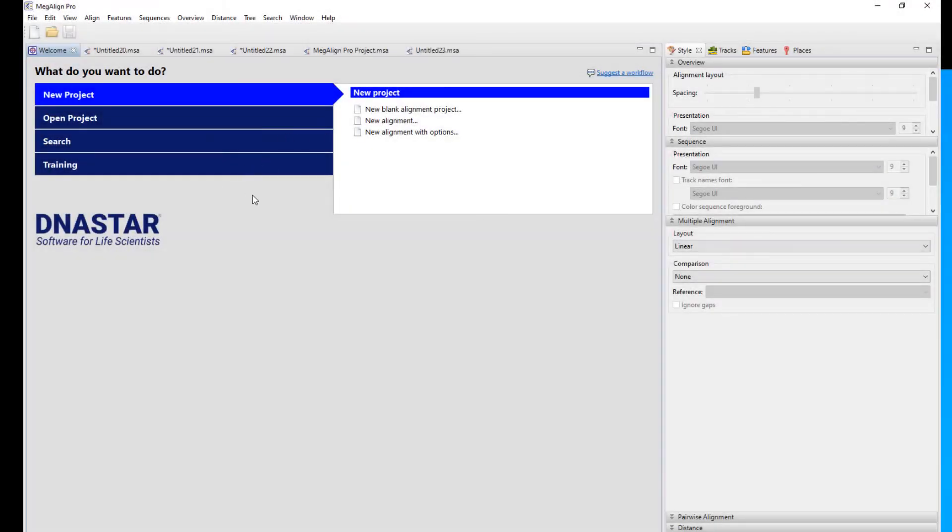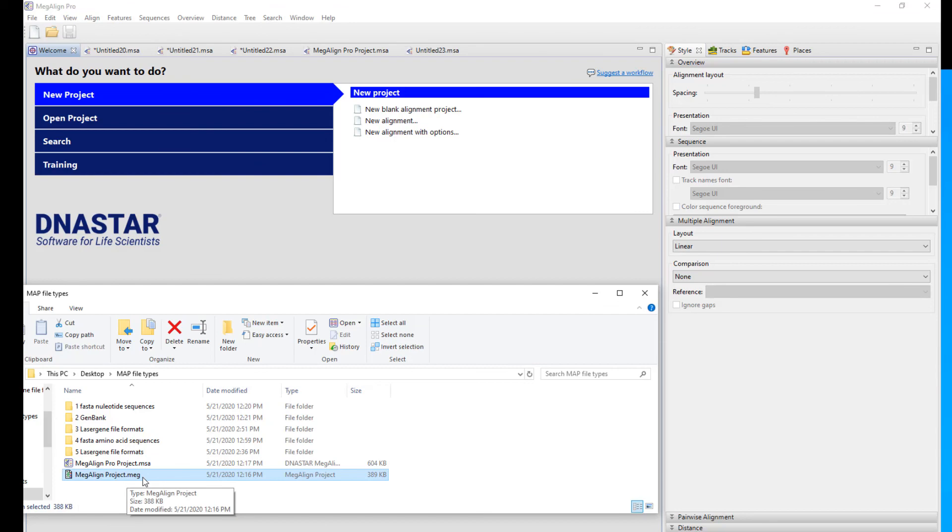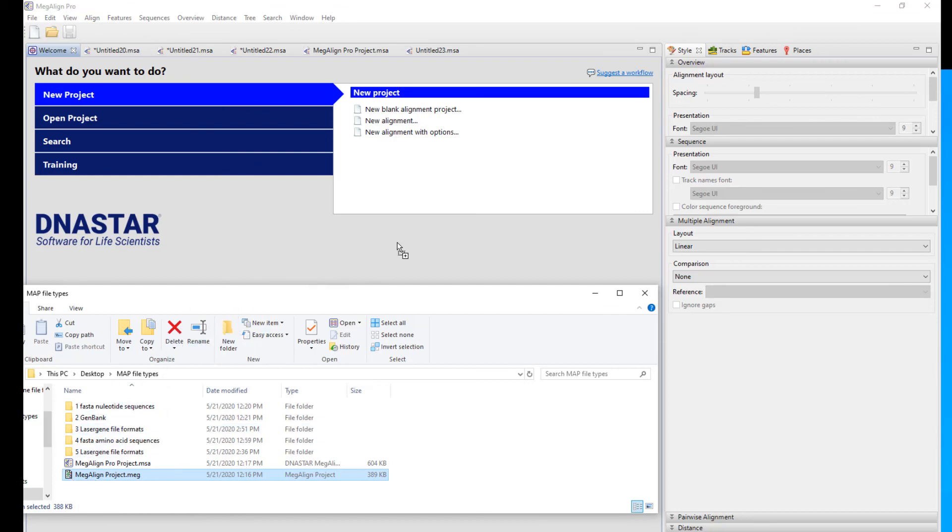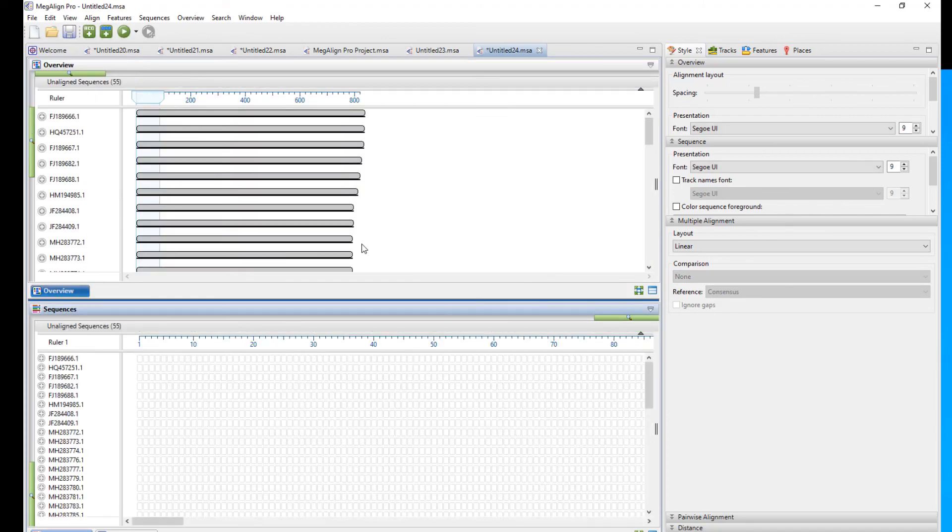And the very last thing I wanted to mention was that if you're a long time laser gene user, you may have used the precursor to the Megaline Pro application called Megaline. And these will have a .meg extension. These can also be added as well. And once again, they can either be added by dropping them on the welcome page or loading them into a blank document.